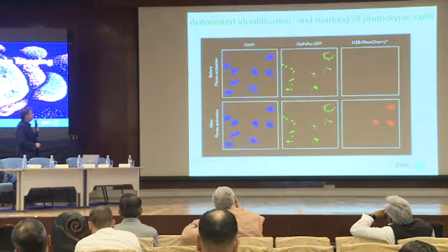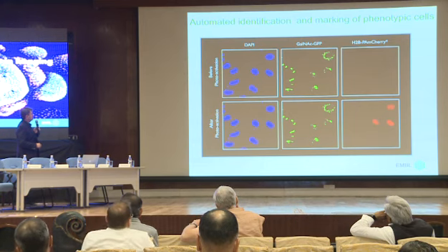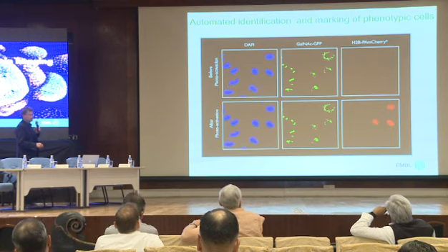One way that we have come up with to do this is a method that we developed together with colleagues from Lars Steinmetz's laboratory at EMBL. We have expressed in these cells a photoactivatable red fluorescent protein, which is dark unless it is photoactivated. Then we automatically analyze which of the cells show a phenotype, like these three over here. We then illuminate them with UV light in order to turn them red, which allows us subsequently to identify them in the entire population.